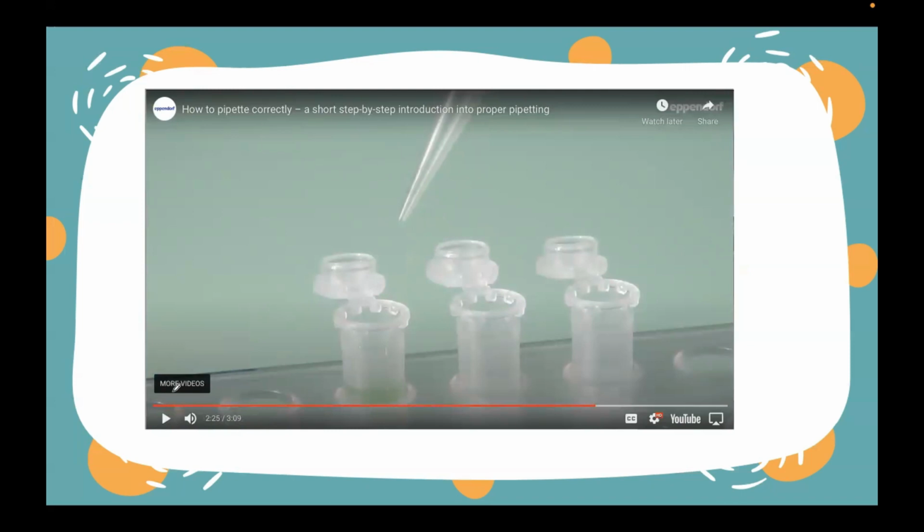Okay? So, nung nag-aspirate ka, first stop lang yon nung kumuha ka ng liquid sample. And then, nung inilipat mo siya sa ibang microcentrifuge tube, second stop na siya. First stop and second stop para lahat po ng mga liquid na kino-contain ng inyong pipette tip, mas matransfer mo siya fully. Okay? Nung nag-aspirate ka, nung kumuha ka, dapat vertical lang angle, 90 degrees. Pero nung inilipat mo siya sa ibang microcentrifuge tube, nung dinispense mo na, naka 10 to 45 degrees angle na po siya.